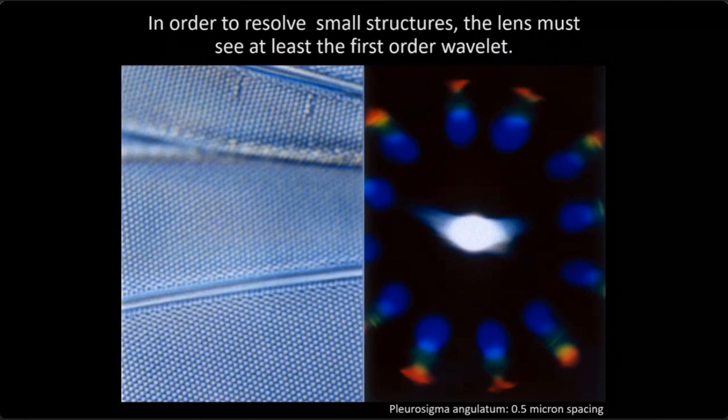Now, you can actually see this happen. This is an interesting thing to do. If you set this all up and take the head off of your microscope and put a piece of paper over the back of the objective lens, you'll see the diffraction pattern, but it won't be totally in focus. And then as you raise that paper up, you have to do this in a dark room, you will see that that diffraction pattern slowly transforms itself into that image. And a guy named Fourier figured out how to do this mathematically. So the Fourier transform turns the diffraction pattern into the image, and the image into the diffraction pattern.